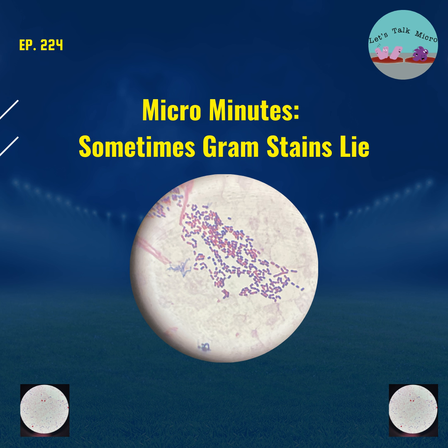Of course, when you're in school and then you start working, some of the Gram stains become really easy and quick. You do the procedure and you can spot Gram positive cocci in clusters and chains, and you can see Gram negative rods. I think the ones we might struggle with the most are the Gram negative diplococci and also the Gram negative coccobacilli like Haemophilus and Pasteurella. I'll talk a little bit more about that.